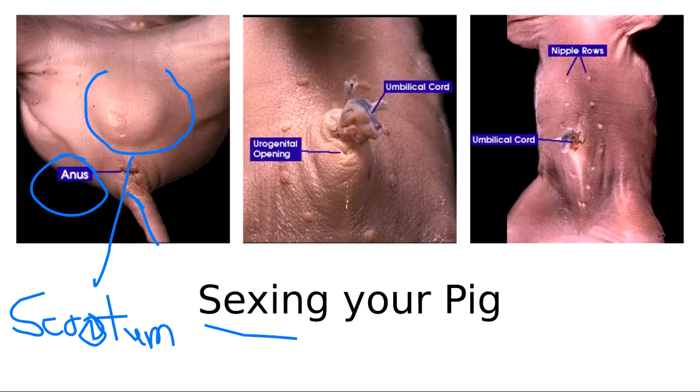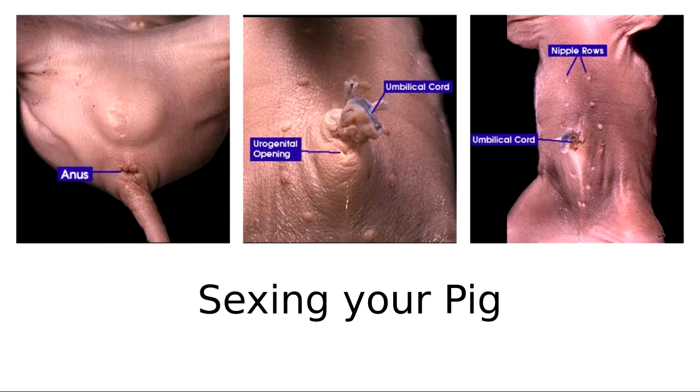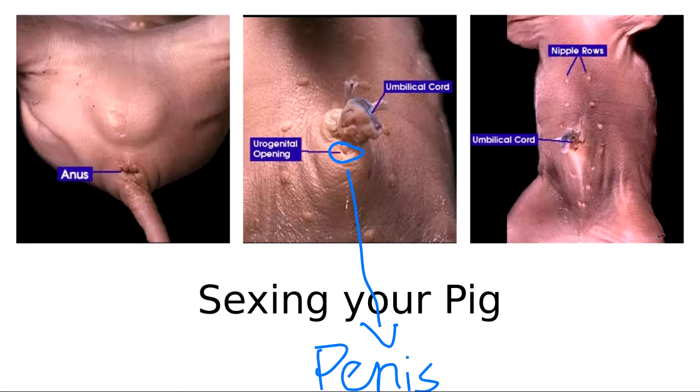And underneath the umbilical cord, that is posterior to the umbilical cord, just posterior, right next to it, really, is the urogenital opening. And this here would be, let me write that. This would be the penis. The opening of the penis is right there. Okay. So here it is again.